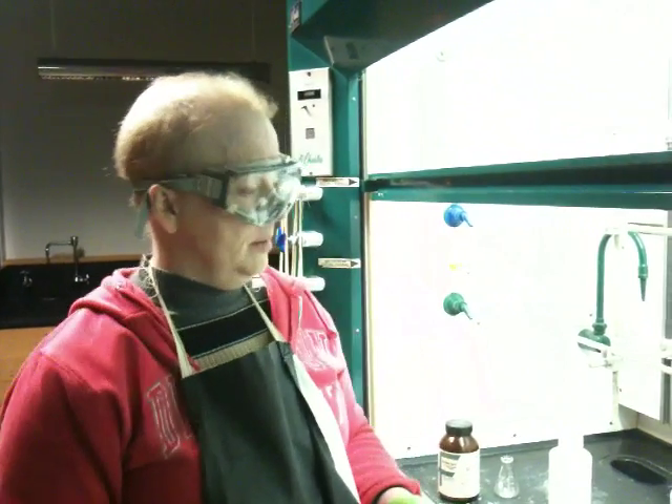Hello class, I'm back in my lab again to show you yet another technique. This is probably not as necessary to watch, but it might be helpful. This week you're going to do your first reaction, which is going to be the bromination of transcinnamic acid. I hope you can find that in the lab book. If you have any trouble, please email me.